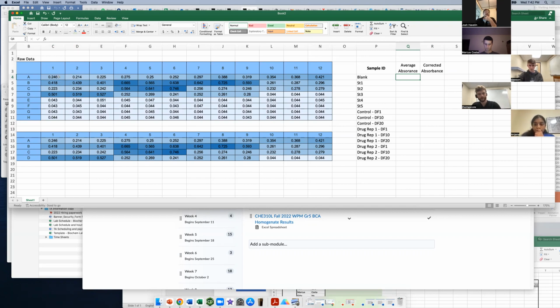The other first thing we want to do is make sure there's no outliers. So I'm making like a 5 or 10% difference from the average, basically, our call for outliers. So like looking quickly at this stuff, these guys don't have any real outliers.